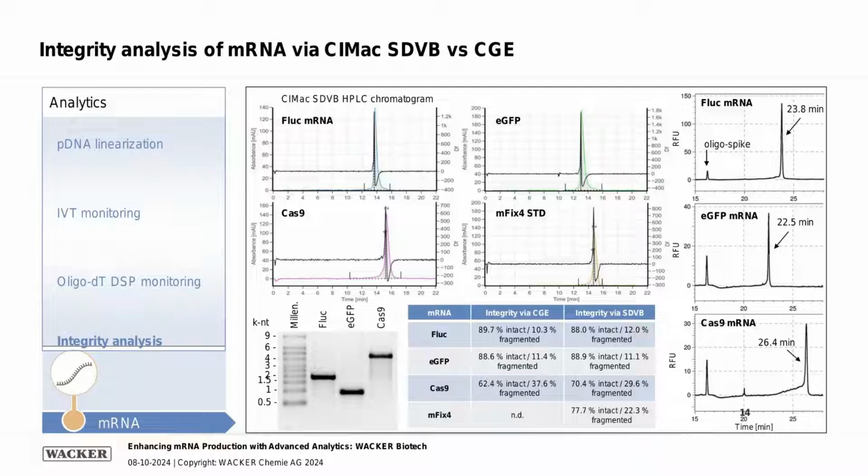To say that these are the first mRNAs we are analyzing with this method, and we just have to generate more data to see if we observe this more often, or if this is just an outlier here.